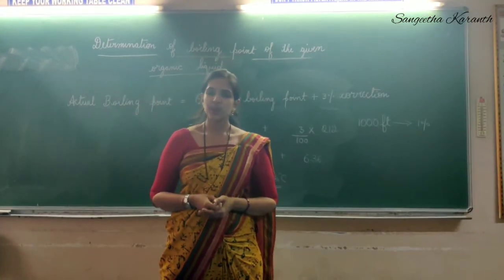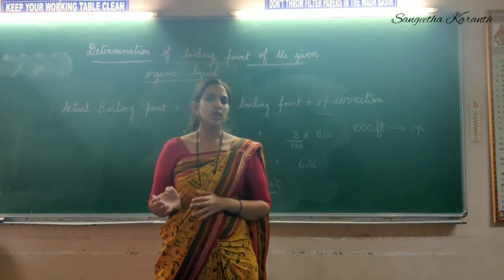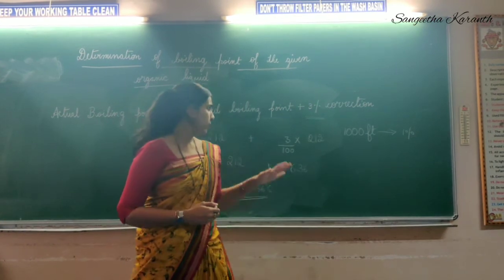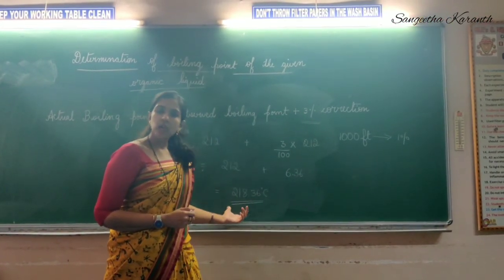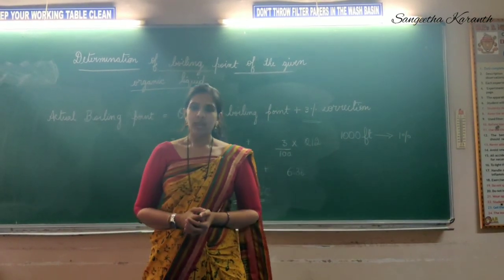In this video I have explained how to determine the boiling point of the given organic liquid by the experimental method, and I have also explained how to do the simple calculations to find the actual boiling point of the given liquid. Thank you all for watching.